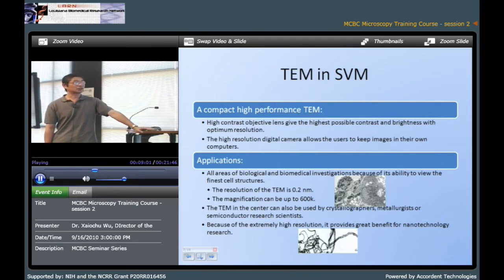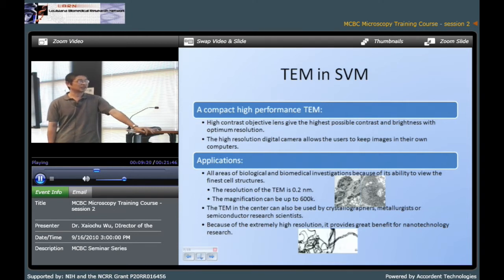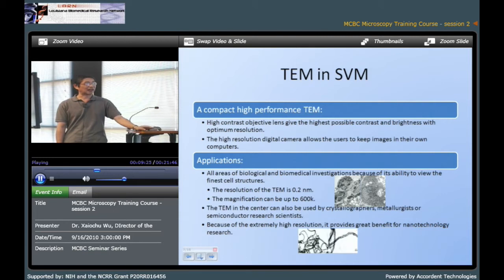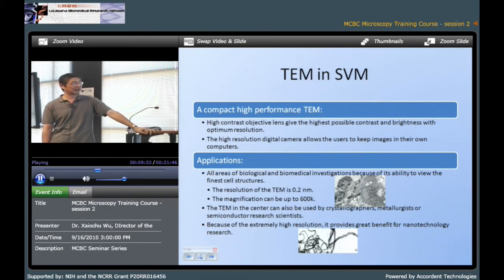The TEM in our school is a high contrast and brightness TEM. It has very good resolution. It also has a high resolution camera, which allows you to copy the image into your computer. This microscopy can be used in biological and biomedical science research. It has very good resolution — the resolution can go down to 0.2 nanometers and the magnification can go up to 600,000 times. Here are two pictures of micrographs made by our TEM. This TEM can also be used in materials science research, especially for nanotechnology research.